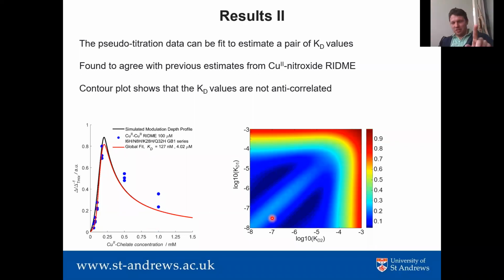Quick question. Just thinking about what Angelica said. What if you do the DEER experiment? What you did was a different concentration, and to determine how many coppers are bound, you can simply vary the flip angles. I don't know how RIDME necessarily works, but in DEER you can pretty much just vary the power of the flip angles.